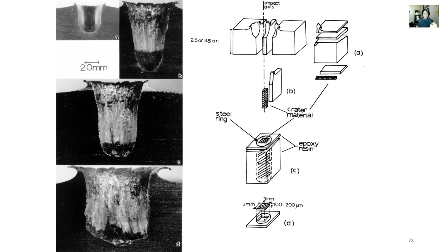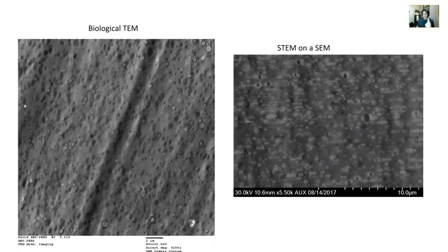And so if I'm using a TEM where I'm putting one specimen in at a time and you have to go through taking your specimen out, cycling the chamber holder to bring it to atmosphere, then take it back down in the vacuum, it's a lot of time. If you have an instrument like what I have where I can look at 12 at a time, it's a time saver actually. So I can make 10 specimens one day, look at all of them either the same day or the next day. Anyway, kind of rambling on, but there are differences between STEM and TEM.